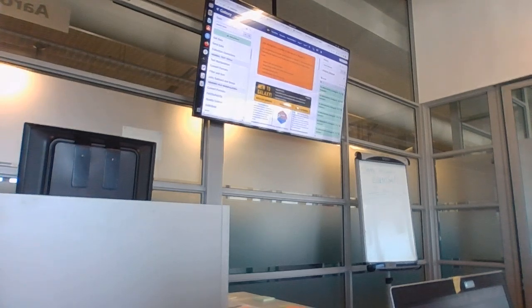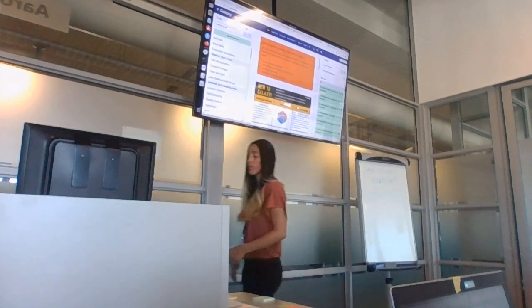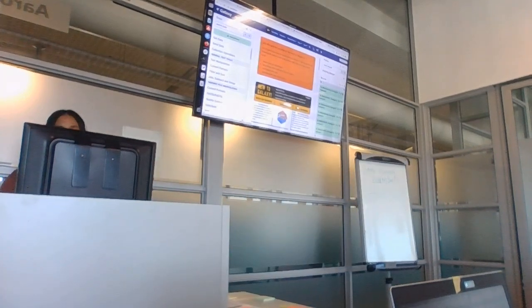Unfortunately, those who couldn't, is yours working? Yeah, delete that one. You can close that part. Unfortunately for me and Dafa, who didn't upload it or download it, we have some extra stuff on our file names.